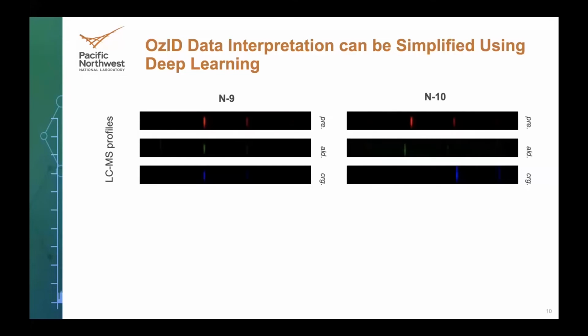It's got all these complex stepwise considerations of each piece of information in turn. But if you think about this problem in a slightly different way, there's an interesting way of formulating it. When it comes down to evaluating different double bond positions, the task decomposes into a pretty simple comparison.